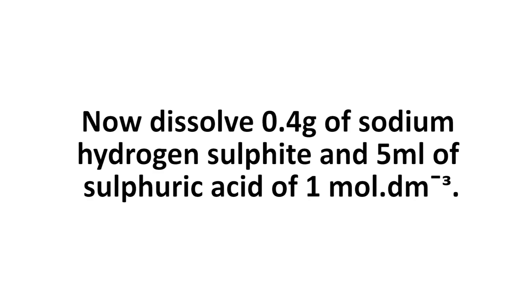In this solution, dissolve 0.4 grams of sodium hydrogen sulfite and 5 ml of sulfuric acid at a concentration of 1 mole per cubic decimeter.